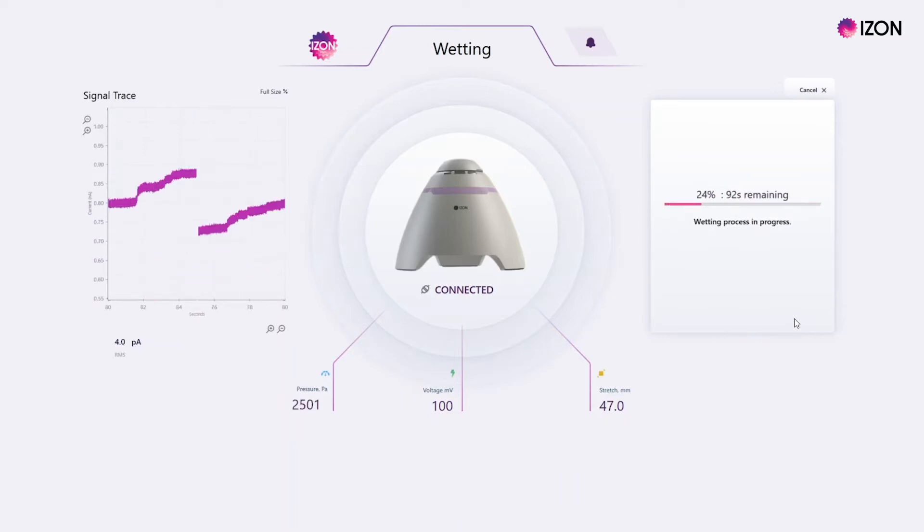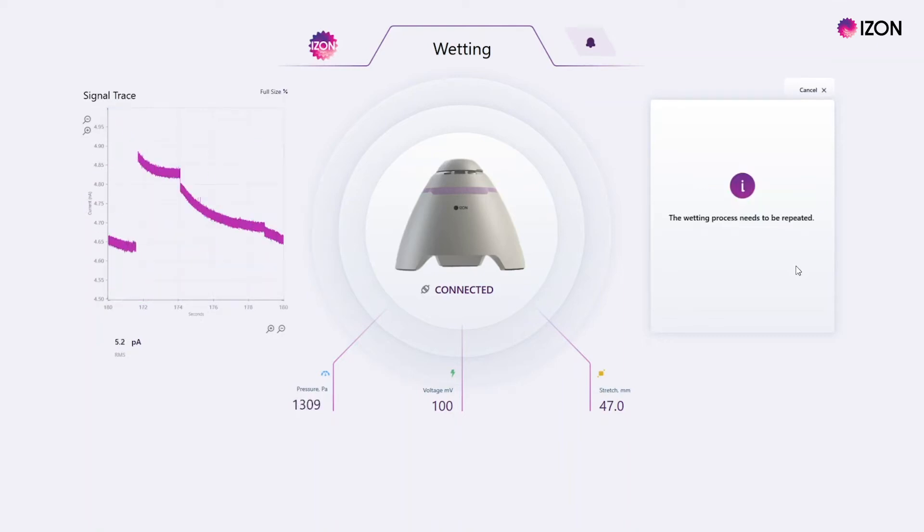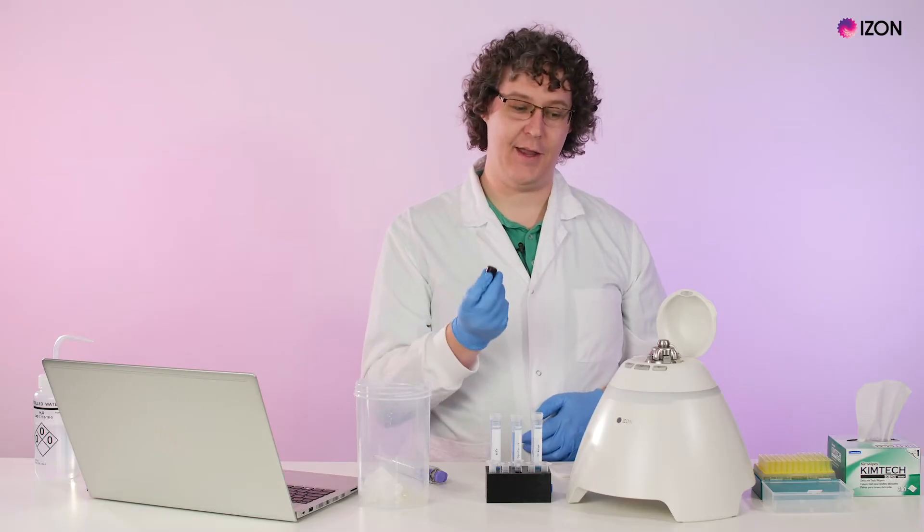Wait for the wetting process to complete. If the pore does not wet after two minutes, you may need to tap on the pressure nozzle firmly with the back of your pressure application device.